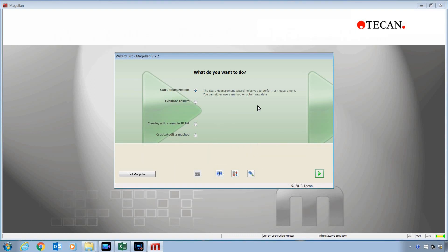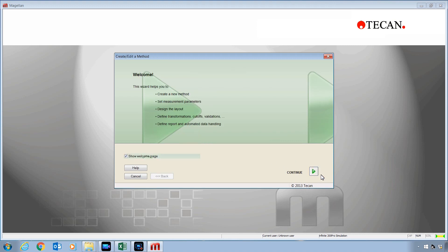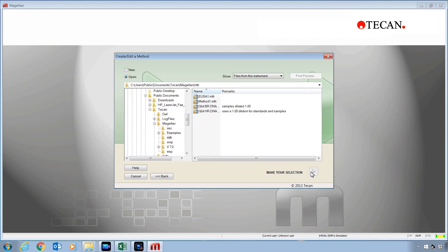Your first step will be to turn on the microplate reader and then launch the Magellan software. At the What Do You Want To Do screen, select Create Edit a Method and then the Next button. If this is your first time using the software, uncheck this box so that this welcome page does not pop up the next time. Then select Continue.